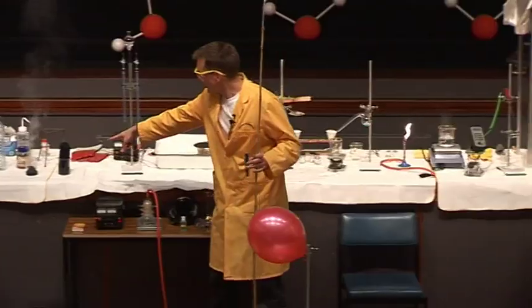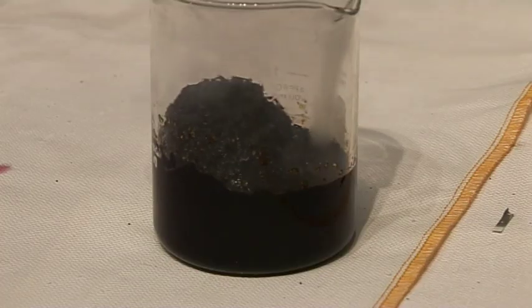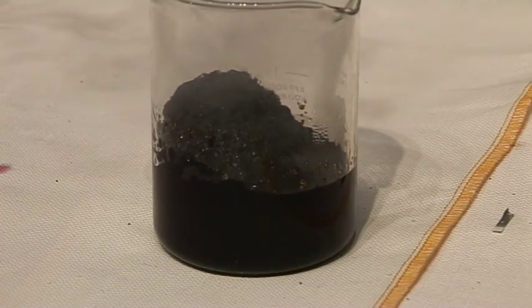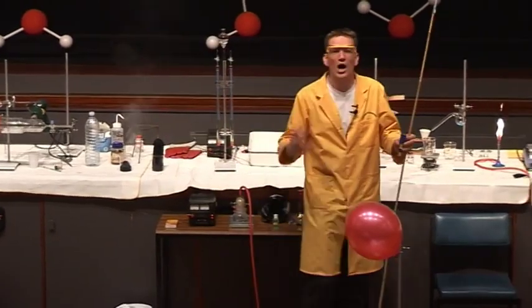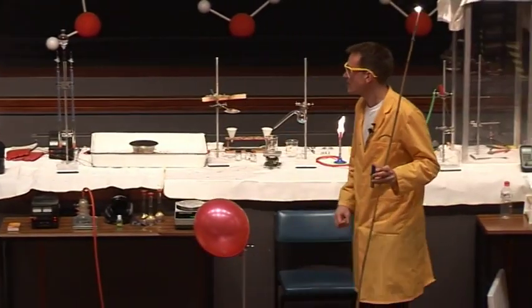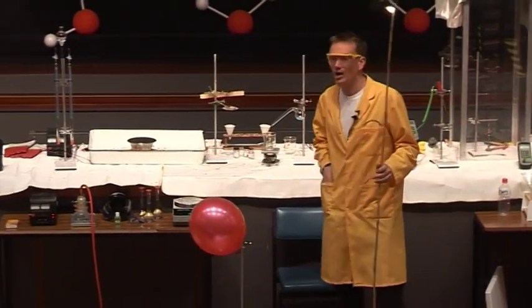Notice our sugar is beginning to react quite vigorously there. There's actually a lot of heat being formed from this reaction, and that's creating steam, which is causing some of the bubbles and the carbon there that's forming to rise up. But anyway, so that's the sugar being dehydrated. Anyway, back to our gases.